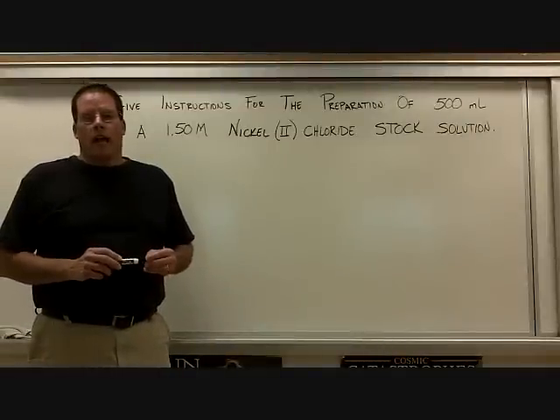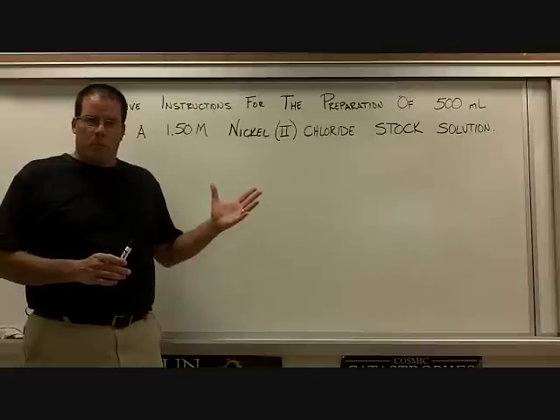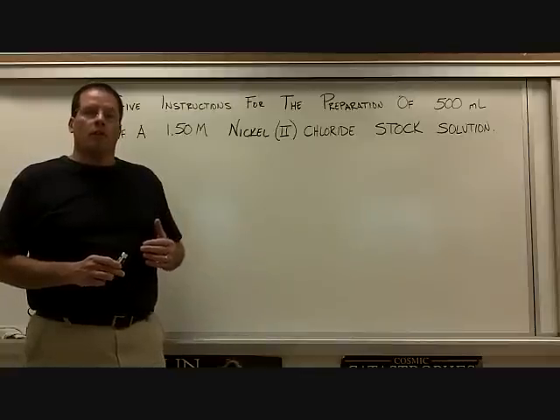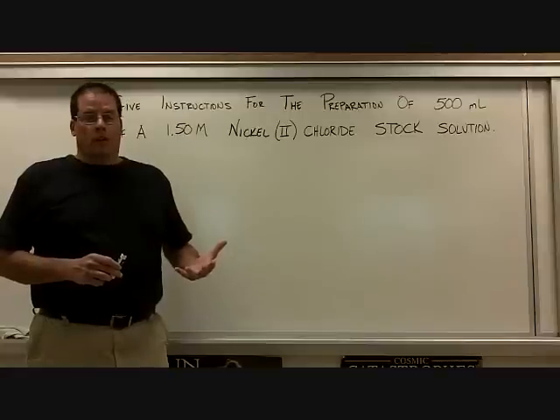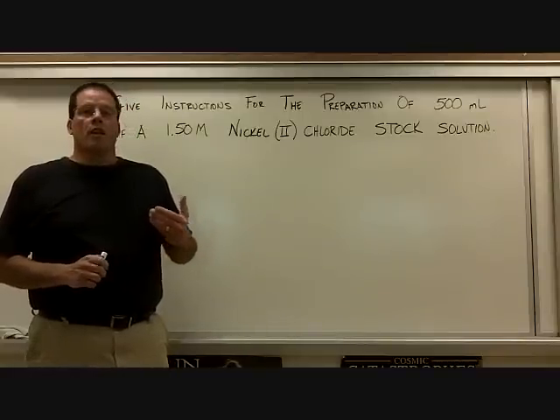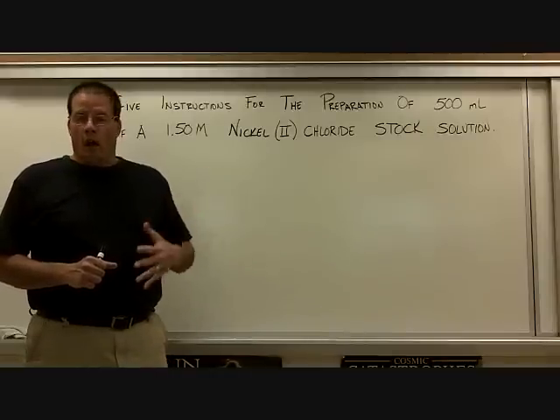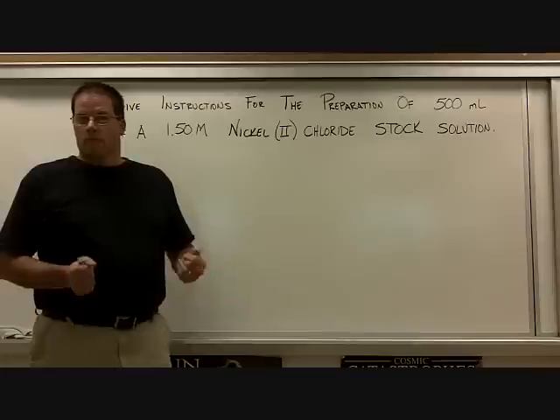Hello, this is Mr. Craig, and I've had a couple students ask about stock solution preparation and then going from the stock solution to a dilute solution. So I'm going to do a couple problems to actually illustrate the calculations involved with that, and then I'm going to have my son Samuel help me make these.